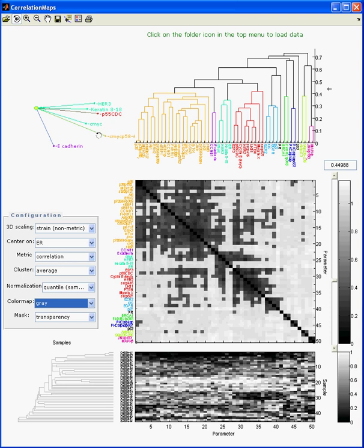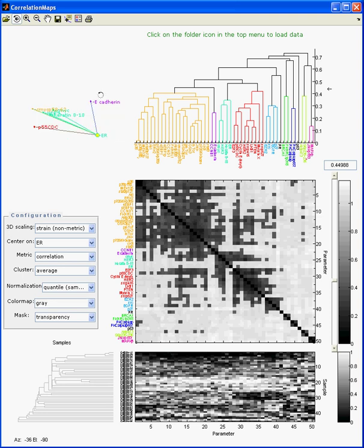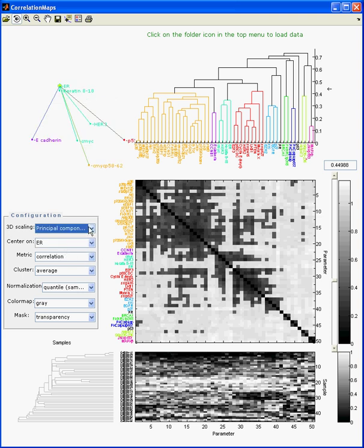There are also a number of tools for the projection of one of the parameters and its neighbors. PCA — principal component analysis — is an example, but there are a number of other tools. What we are able to pull into this graphic interface is all these computational statistical tools: top-down dimensionality reduction like PCA, bottom-up exploratory analysis using cluster trees, looking at the actual cross-tabulation of pairwise comparisons between all the parameters, and linking that back to the original data values.